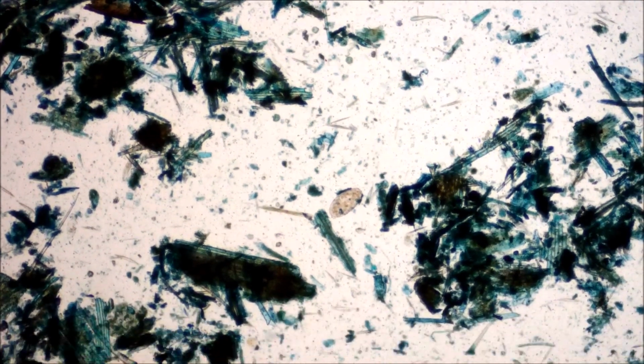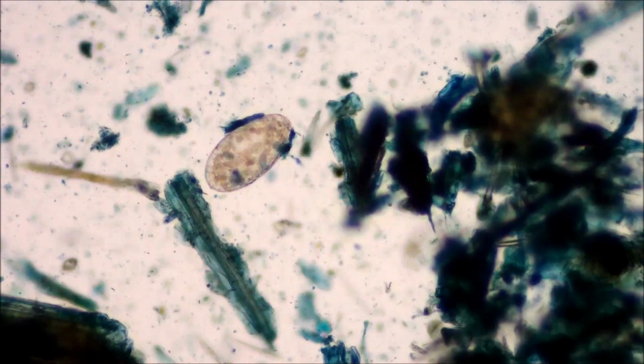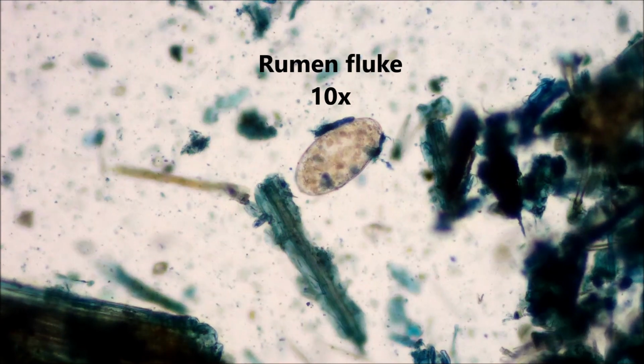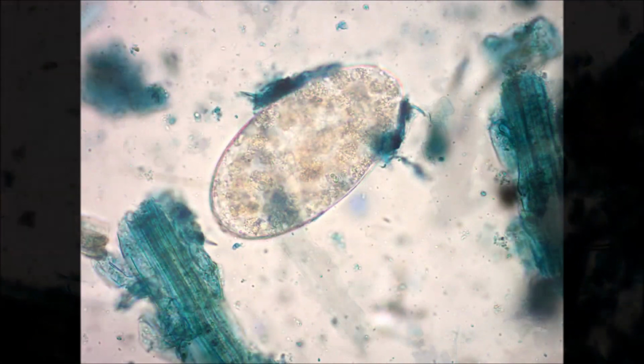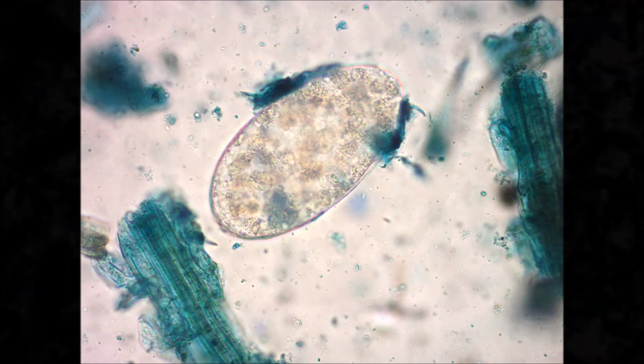Paramphistomes or rumen fluke are large worm eggs about 160 micrometers, averaging 125 to 180 micrometers in length. They are a pale grey, greenish or light brown egg, and like Fasciola also have a pole lid or operculum at the end. Again, if you need to see further morphology, increase your magnification to 40x.